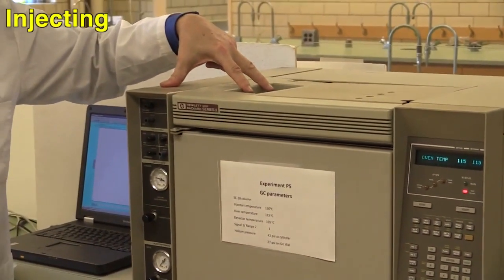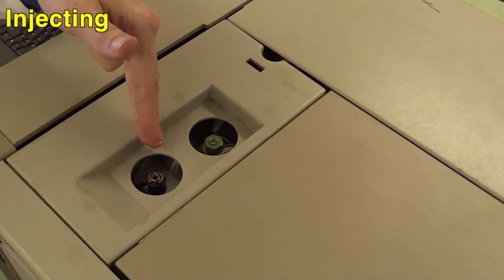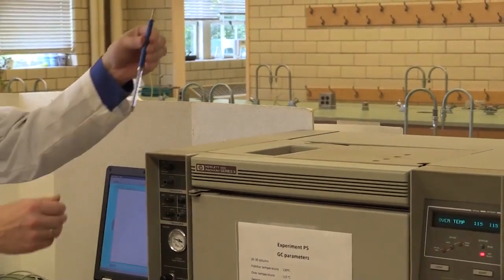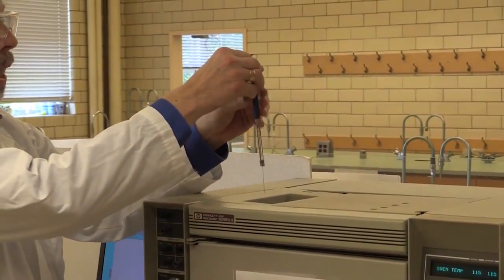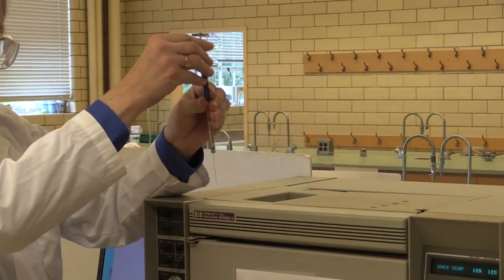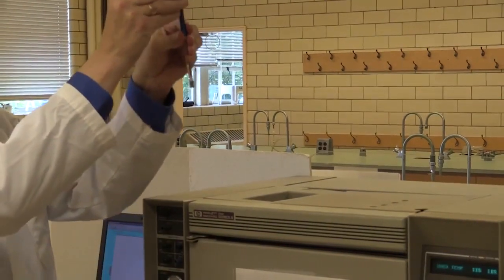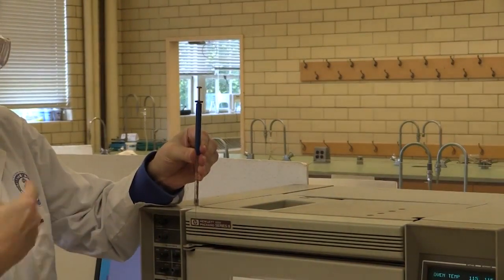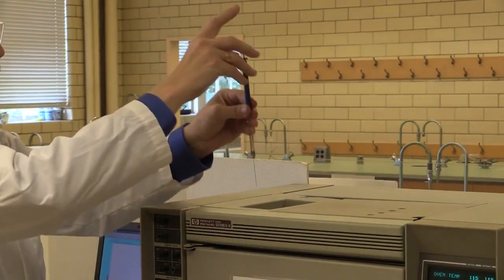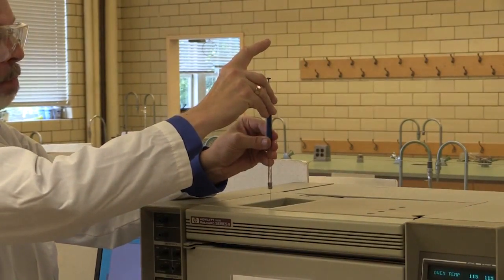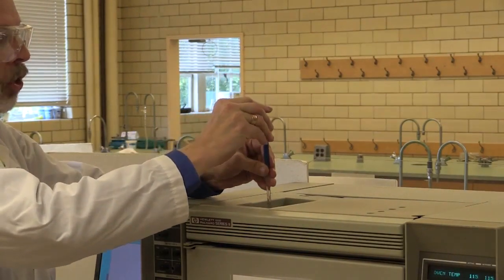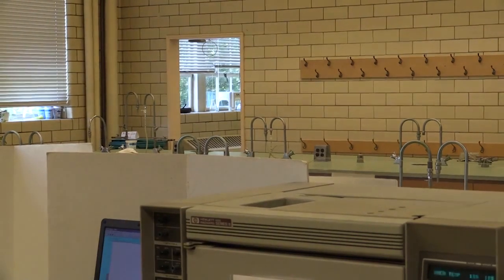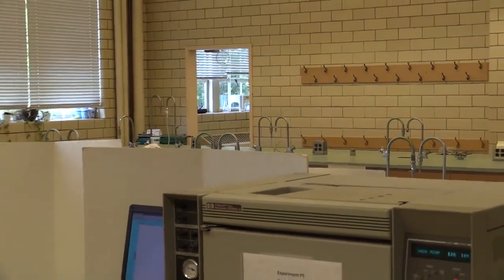There are two injector ports up here. You'll be using the front one. And you take your syringe. And when you inject, you need to do this as smoothly as possible. So it's in, inject, out. Don't push it in and then hold it for a bit and then decide to push. If you do that, you get a really ugly looking injection. So hold it as vertically as possible, push down, inject, out, and hit the space bar as soon as you can. And that will cause the trace to start detecting.